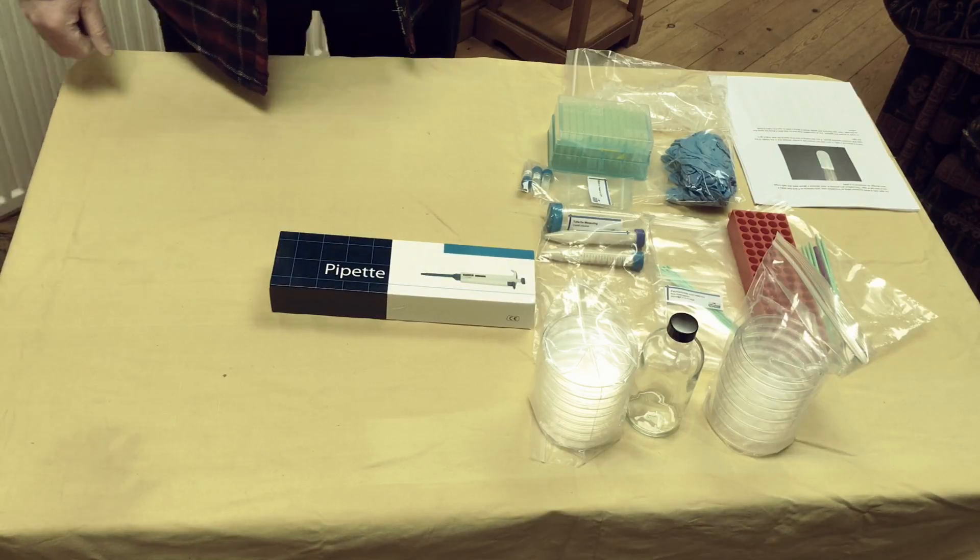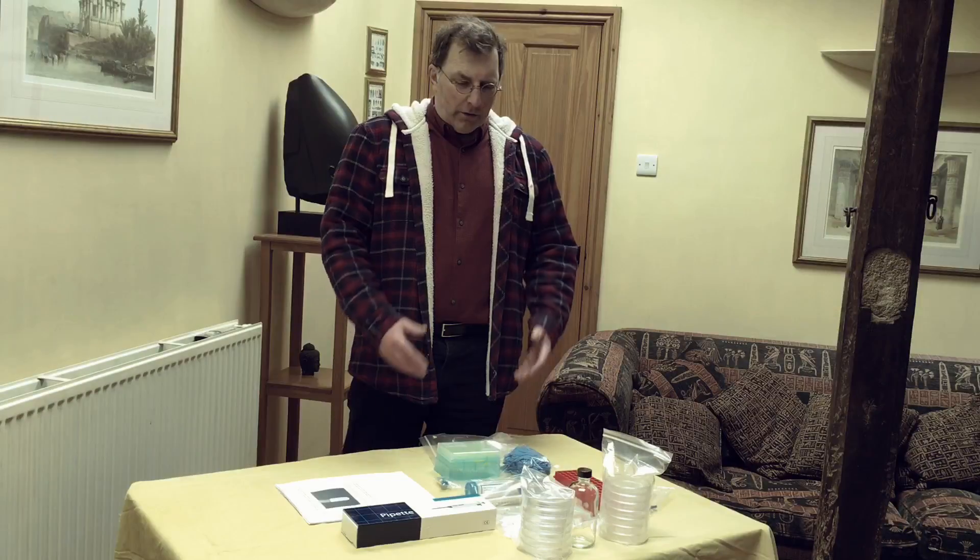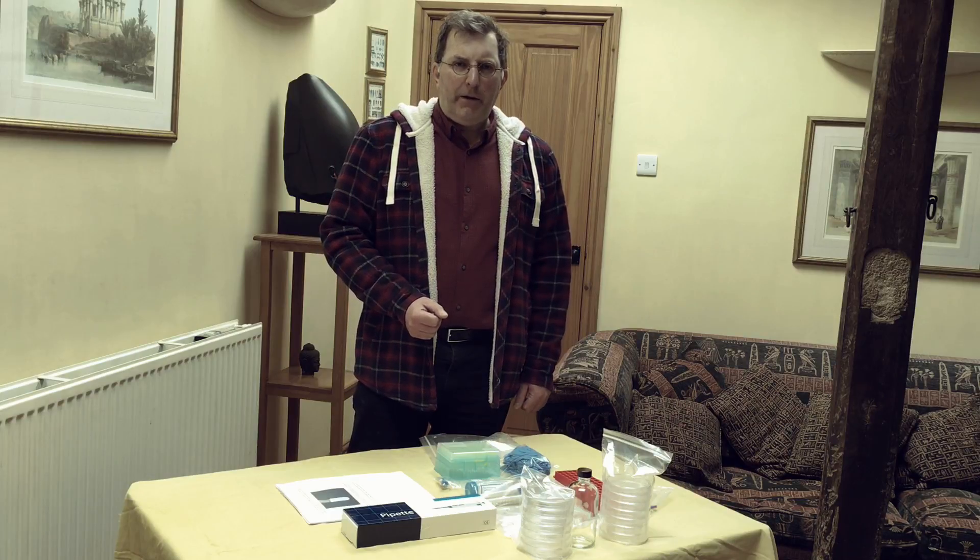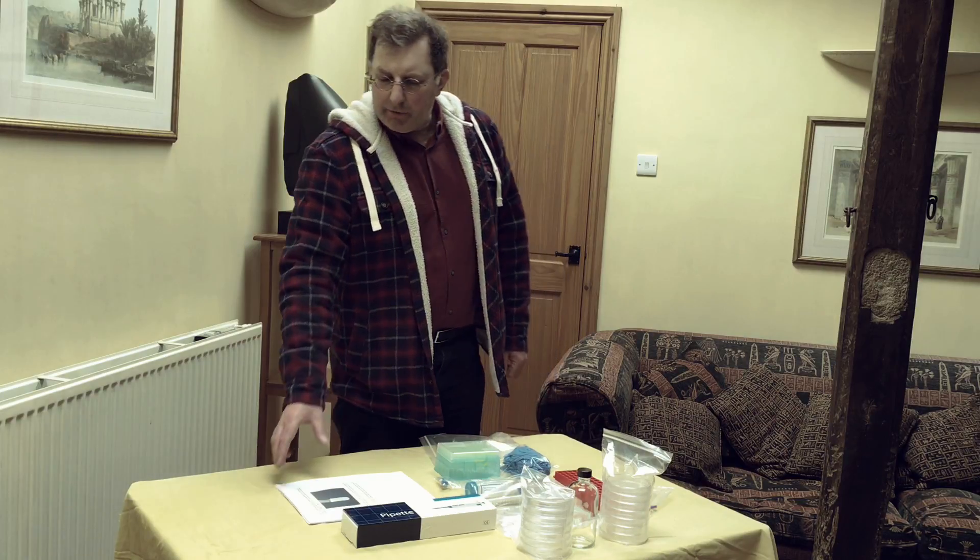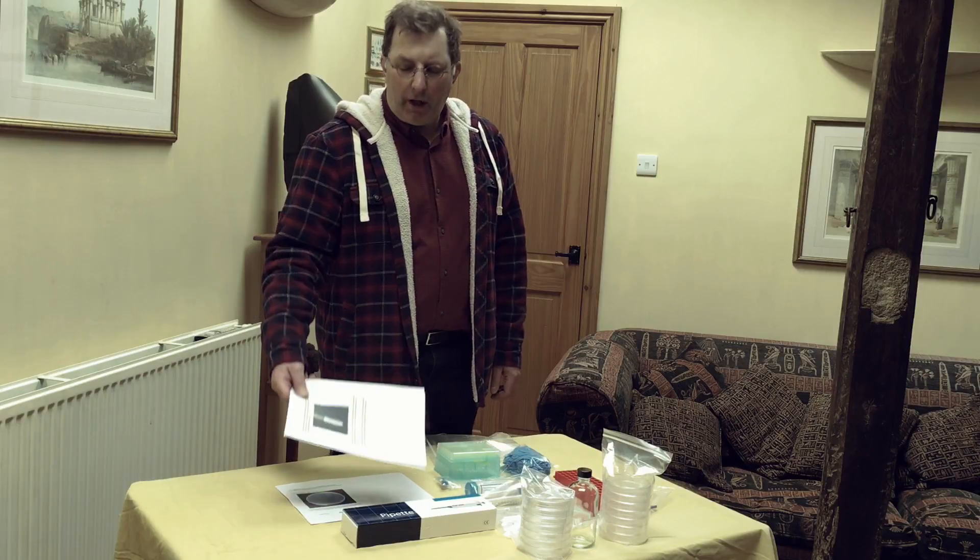And that's it. That's the contents of the box. So here it is. This is all you need to do biohacking. And the next step is to read through this and understand it and have a go at the experiment. And hopefully I'll be able to talk you through that in another video.